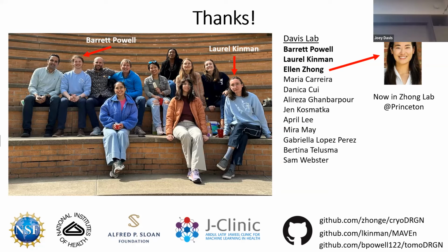The second thing you can do is more or less what I've shown you today, which is you can work on systems for which there is a lot known already. If you're trying to develop these algorithms, then you can basically rediscover biology, which has been validated by other means. The challenge of that is that you send these papers out for review, and one of two things happens. You either recapitulate what people know, and the reviewer says, we already knew that, we don't care, or you find new things, and the reviewer says, I don't believe you. And so I'm sort of with this conundrum.